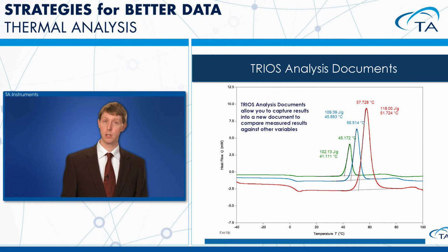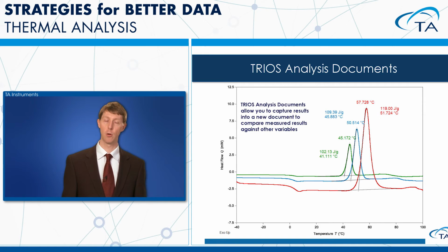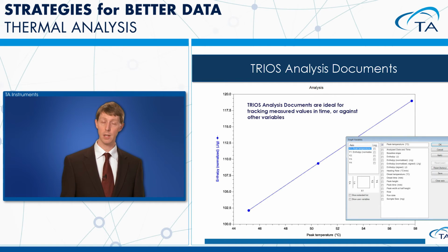Now, Trios utilizes something similar in terms of tabulating results, but it uses something integrated within the software. So instead of utilizing Excel, since some people may not have Excel on their computer, what Trios has done is actually allowed you to create an analysis document. You would create a new analysis document similar to the way you would create a new overlay document, but you would tabulate results. They can be in individual files, they can be in overlays, and you can actually send all of those results that you've tabulated and throw them into this new analysis document. And it's much more flexible, more power to it, simply because you're not having to rely on Excel.